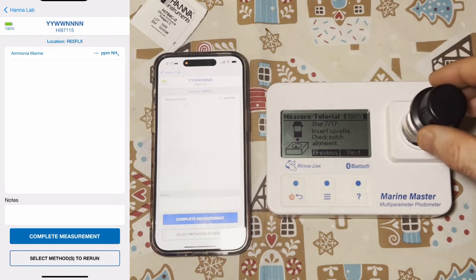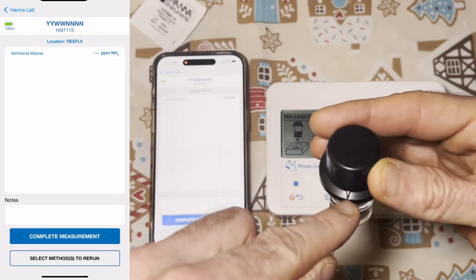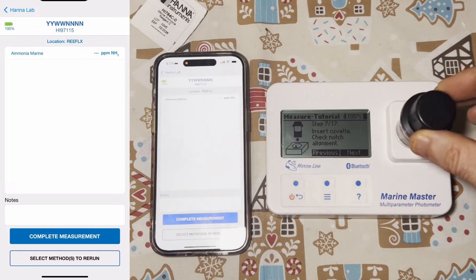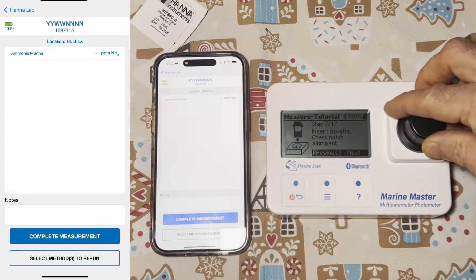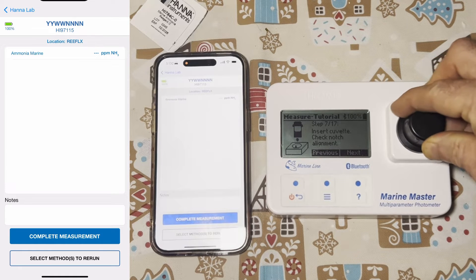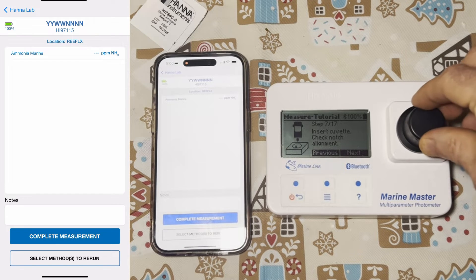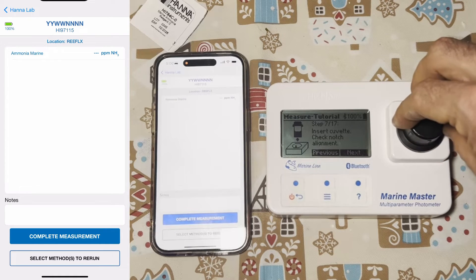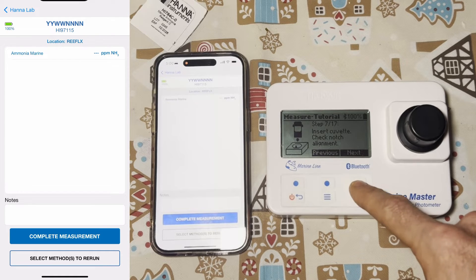Insert the cuvette and check notch alignment. It may be hard to see but there is a little line right here. When I put it in and slide it, you'll feel it kind of click into place — there's very little movement. But when that alignment isn't in place, it kind of just spins all over. So I apply a little bit of pressure to where it needs to go, then click next.